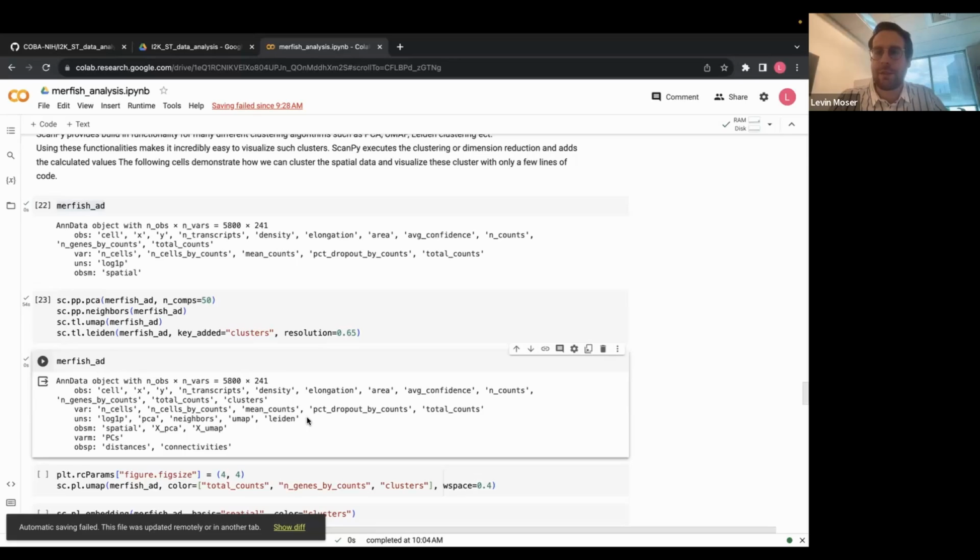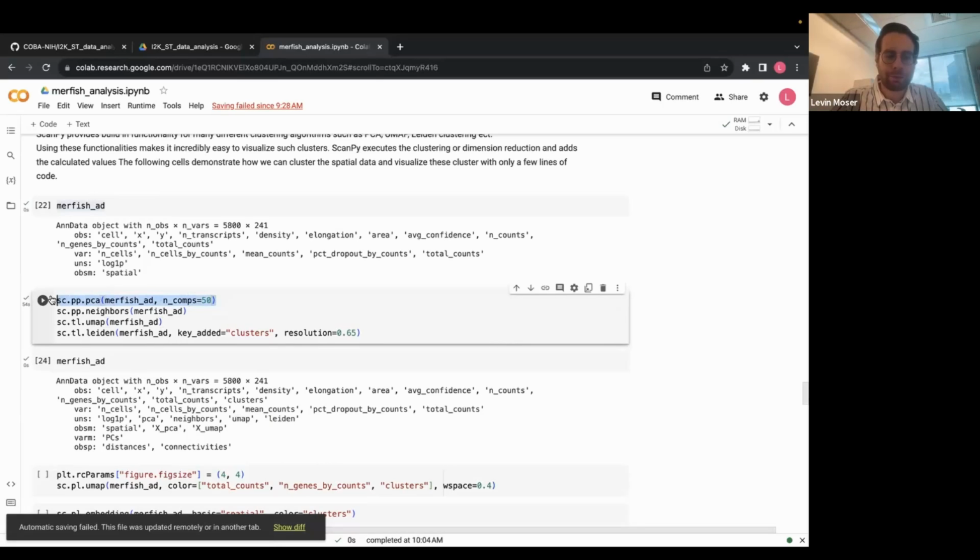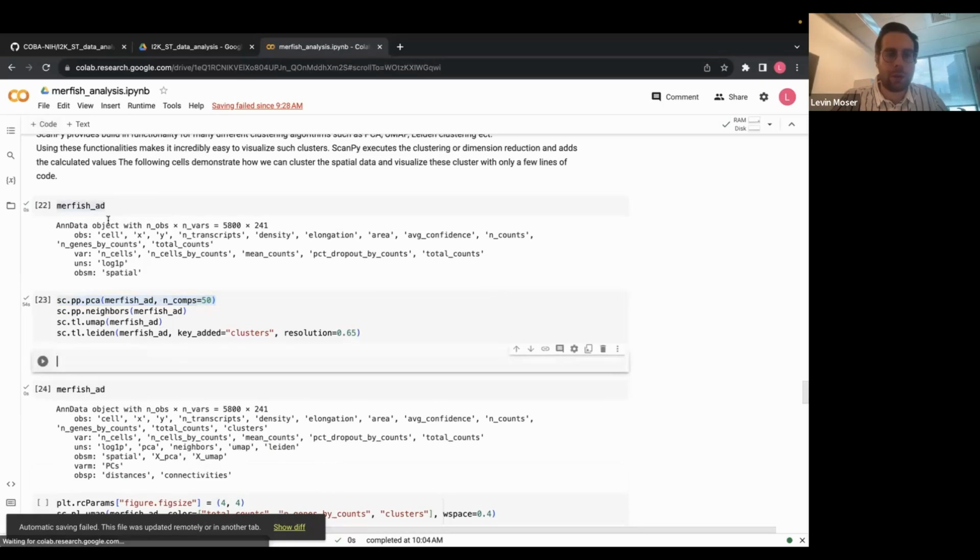This just makes it very, very easy to use, because traditionally, if you would do something with images, it would look something like this: you calculate your clusters and then it returns you something, of whatever data structure size.